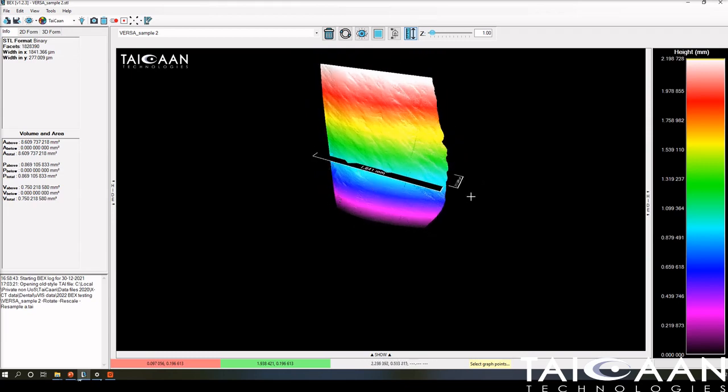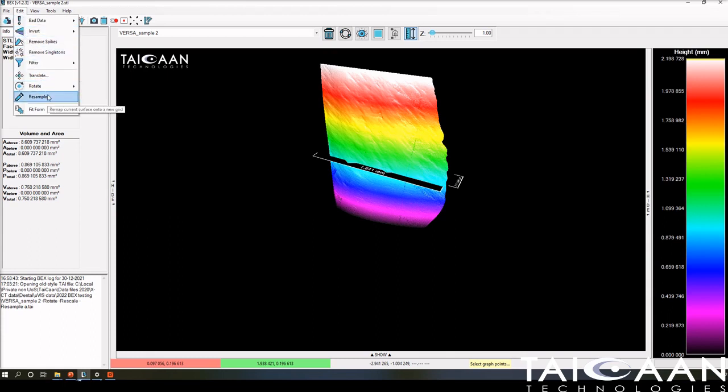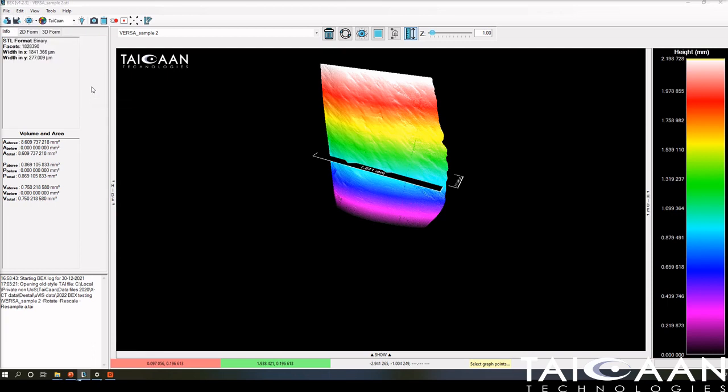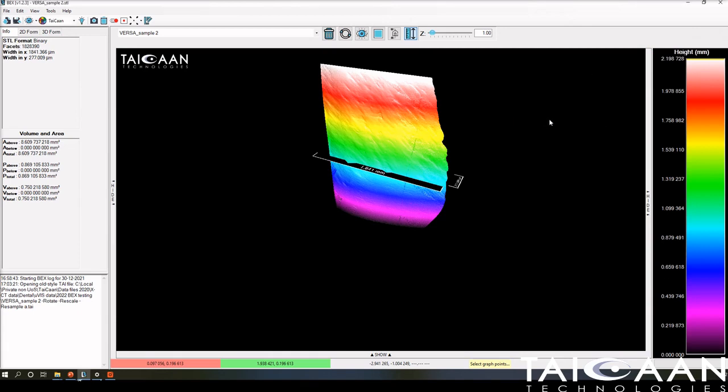We want this plane to be the XY plane. The first thing we need to do: go to Edit, drop down, and here you have the ability to rotate the surface. Not rotate it graphically, but rotate it around its axis from a dimensional perspective. We want to rotate the sample around the X-axis, and I know from prior experience we need to rotate this by minus 90 degrees.